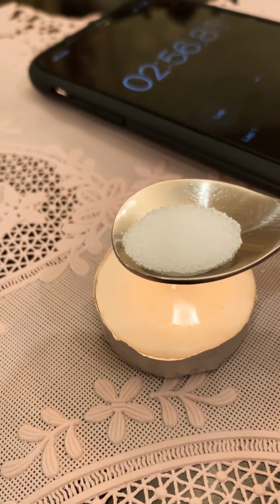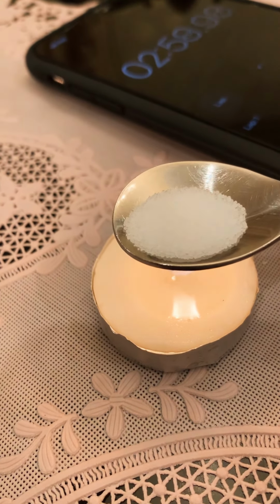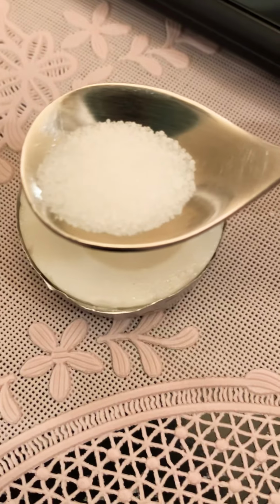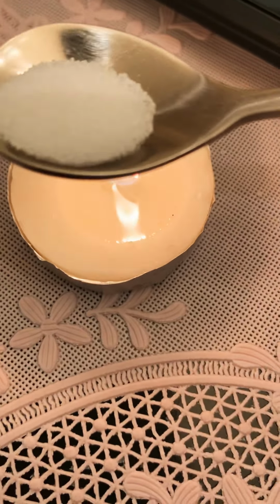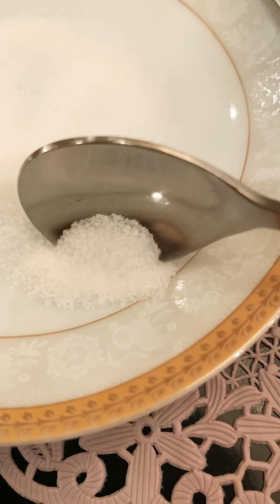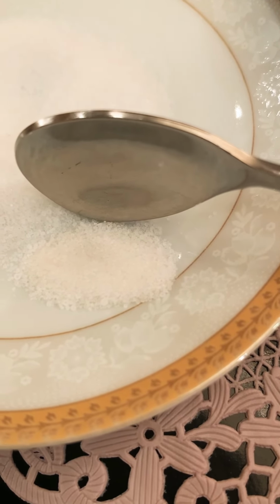Okay, now we have 3 minutes. You can see the salt. Nothing happened to the salt at all. I can put it back in a dish. Nothing happened at all, as you can see here.